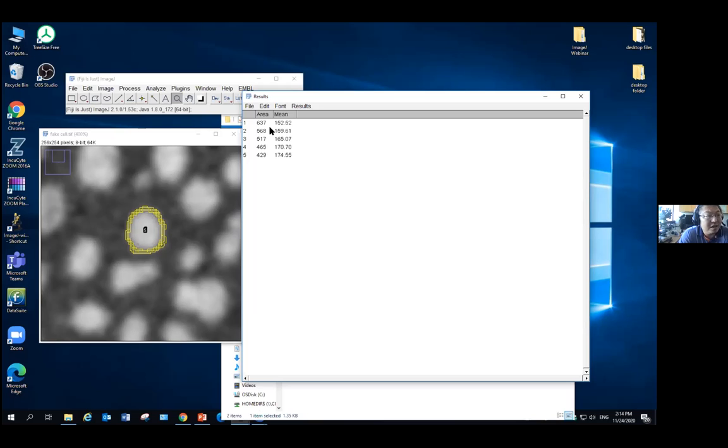And then I know that if I choose the lower thresholding, it actually gives me a bigger size. So when I'm looking at my experimental data, this cell, I may just, maybe not intentionally, maybe just in my subconscious, I hope so badly it will be bigger. And I know you want it to be bigger, you only need to change to a lower thresholding.